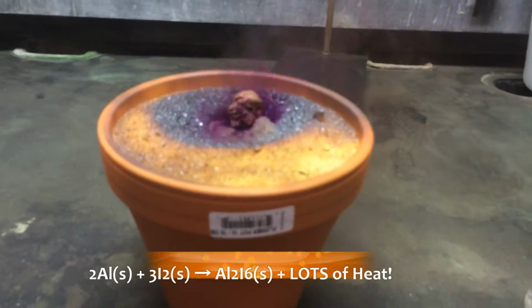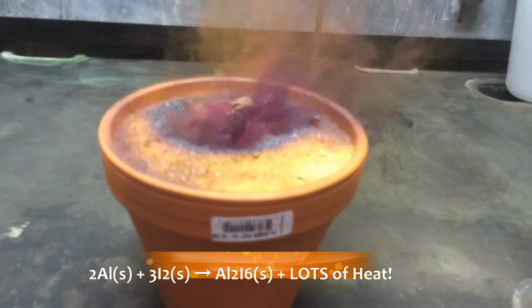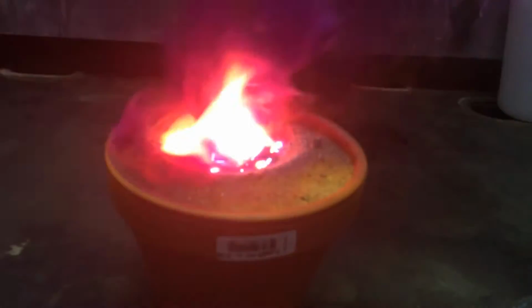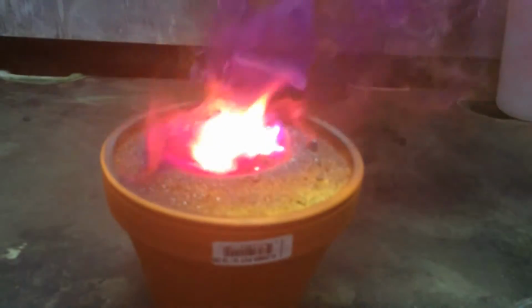However, this is an extremely exothermic reaction. So after just a few minutes, the cool thing happens right there. It bursts into flames, and it'll continue burning until all of the aluminum is consumed by the iodine, producing the aluminum iodide. And it kind of sparks and fizzes, and it's a whole lot of fun. Again, this is one of my favorite reactions to do.